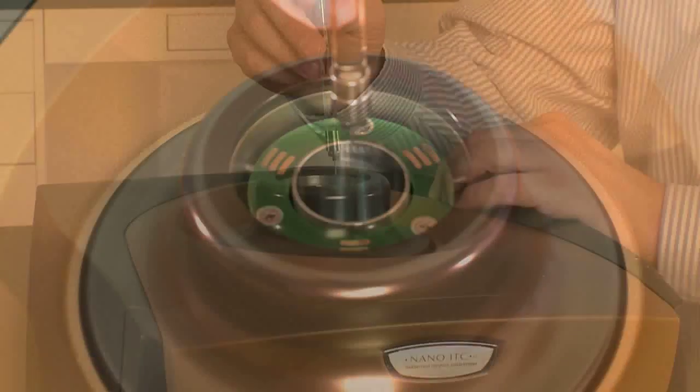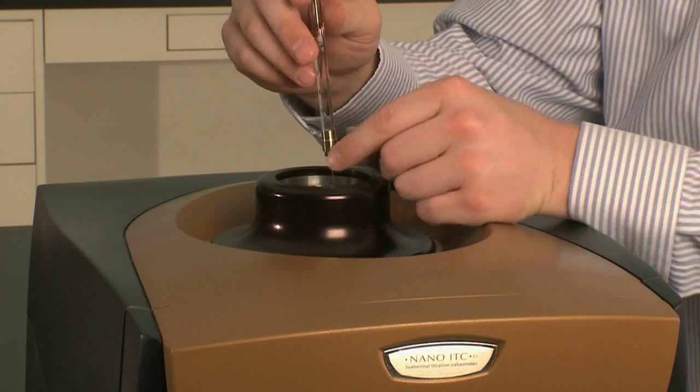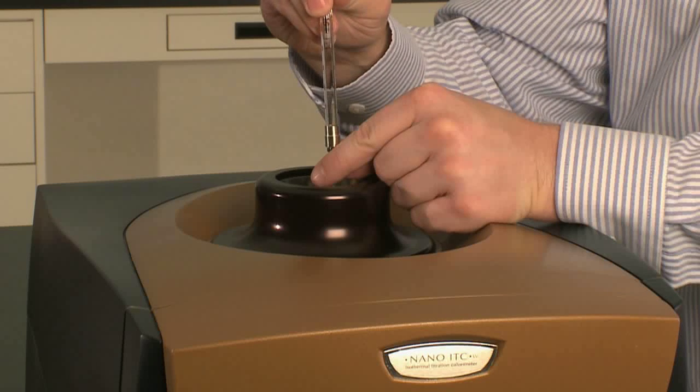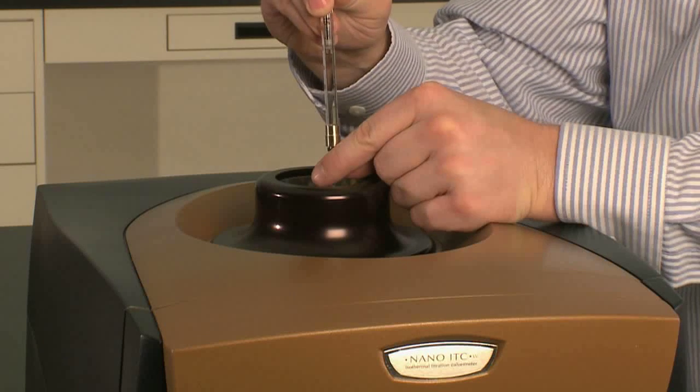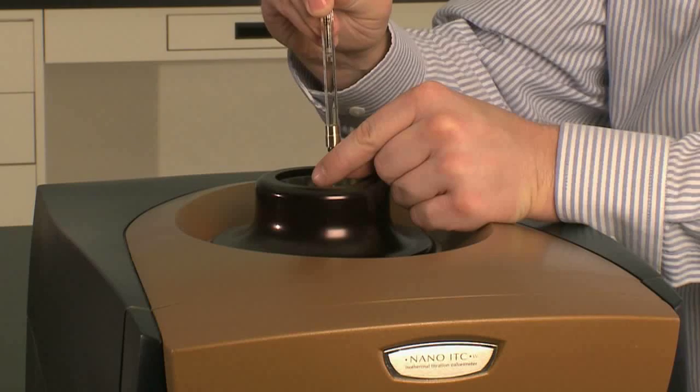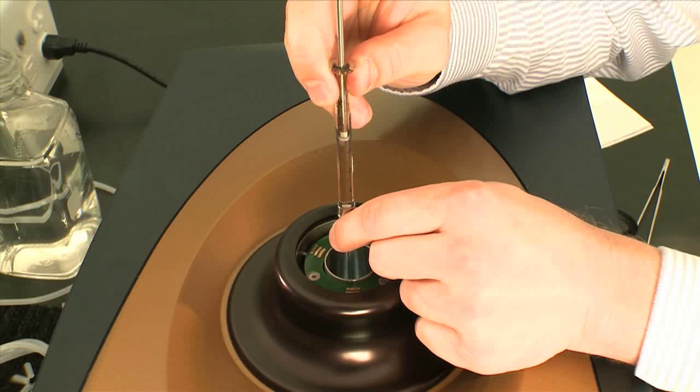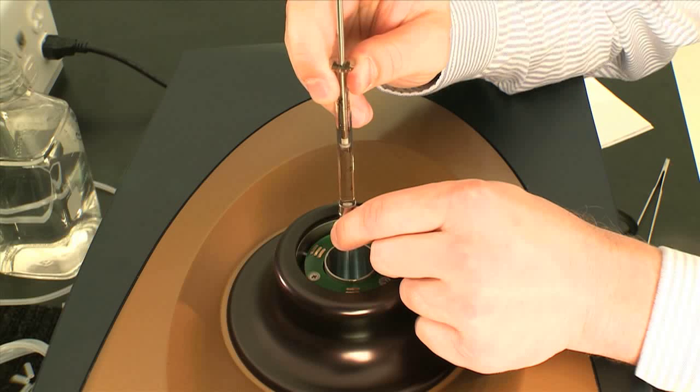I place the needle in the reference side until I just touch the bottom, lift up just slightly, and then slowly inject the water. You want to be careful that you have no bubbles in the syringe, but even if there are bubbles, you just want to make sure that you don't inject them into the cell of the ITC.